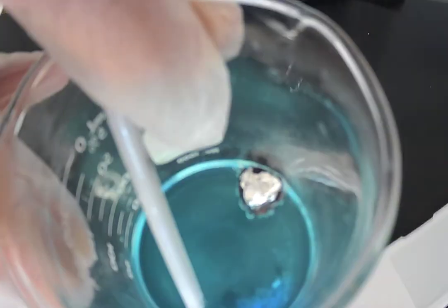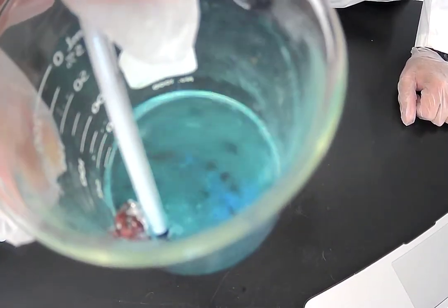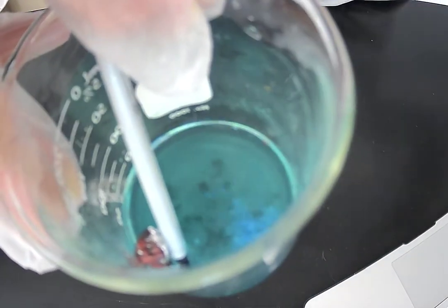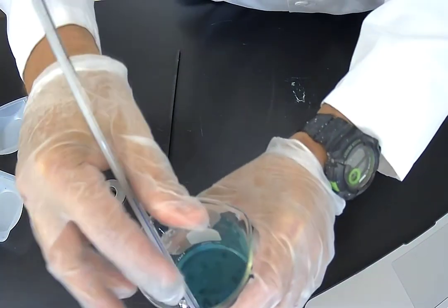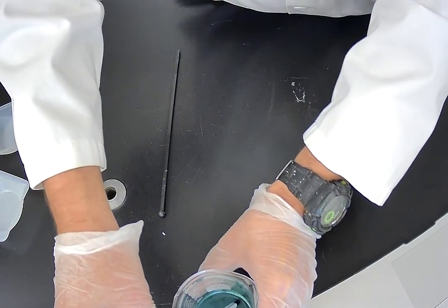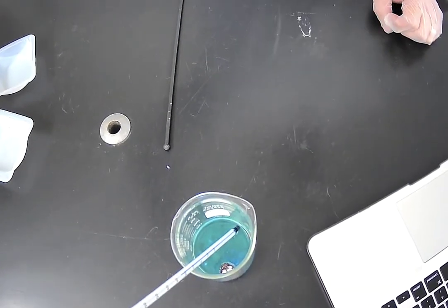Can you see any changes, any observational changes here? Okay, in our first minute, our temperature is 24 degrees, so we had a little climb of 2 degrees.